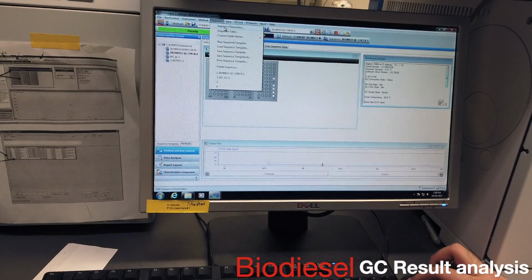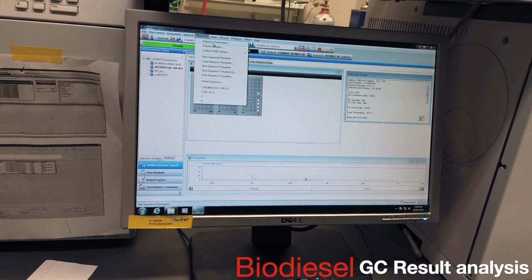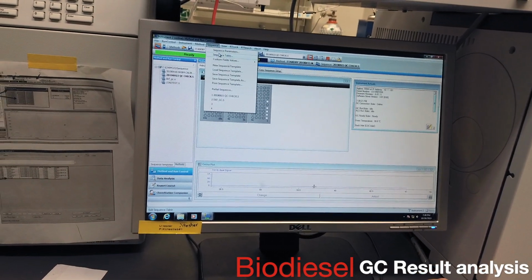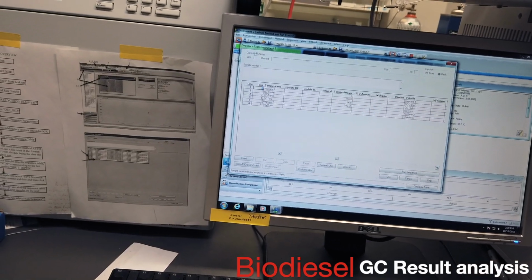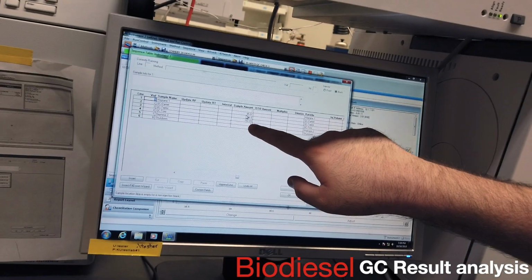But you didn't dilute them; you did it based on the standard, right? Yeah, I didn't. Based on the method, right? So I did the whole thing. Right. So we would always take part of the vial, and so you'd have to say, okay, it's 50 micrograms per milliliter, but we only injected like a tenth of that sample. Oh, okay. I think this is what the issue was.